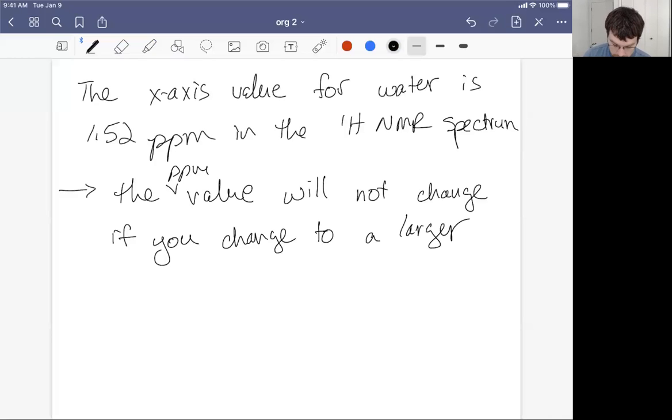That is wonderful. So imagine I'm doing science at Ripon and I'm making molecules and I'm observing their NMR properties by using my 7 Tesla magnet, which has a resonant absorption of TMS at 300 megahertz. And I want to report that data.